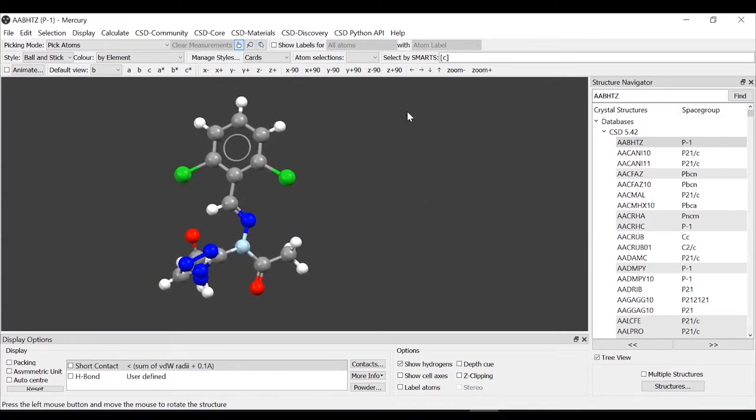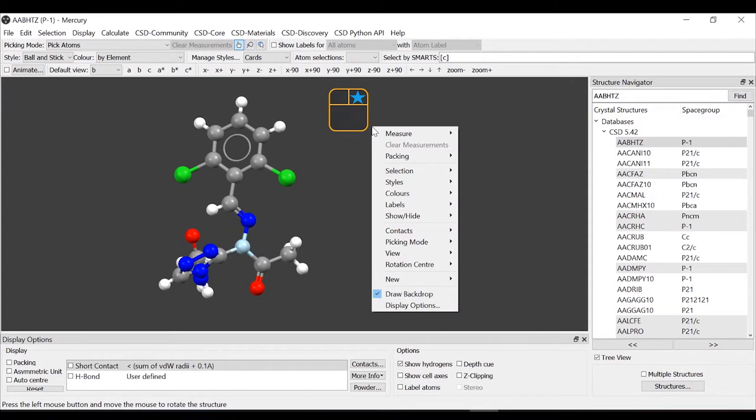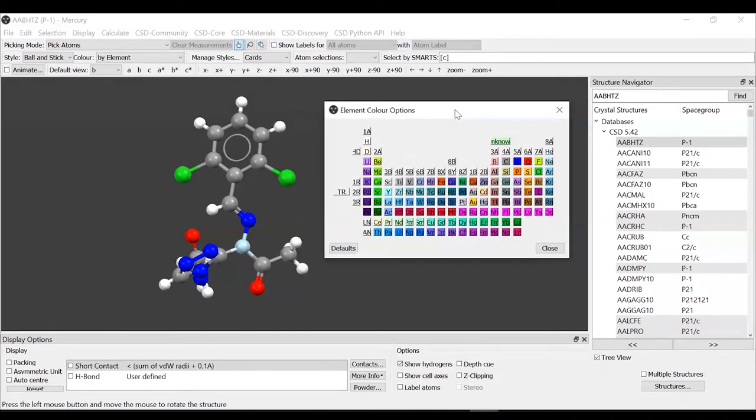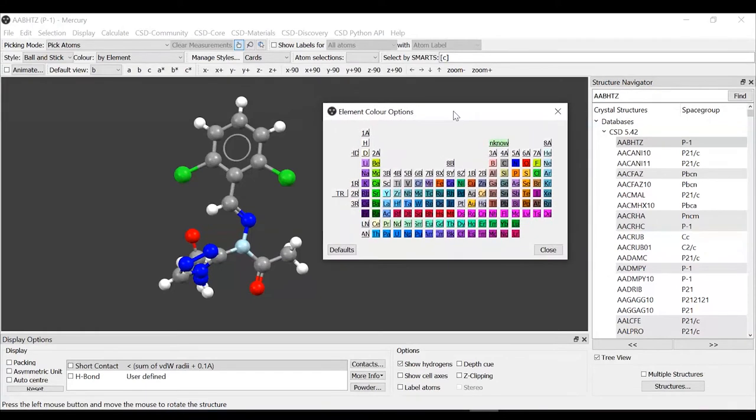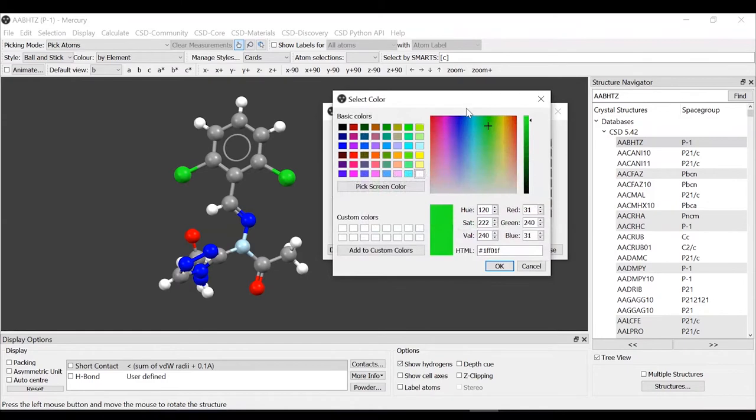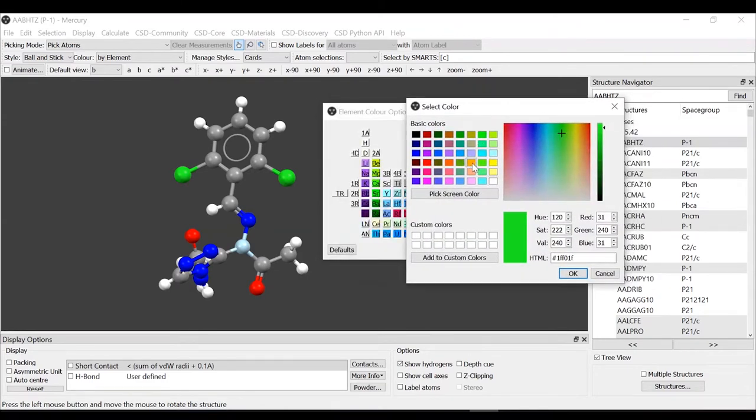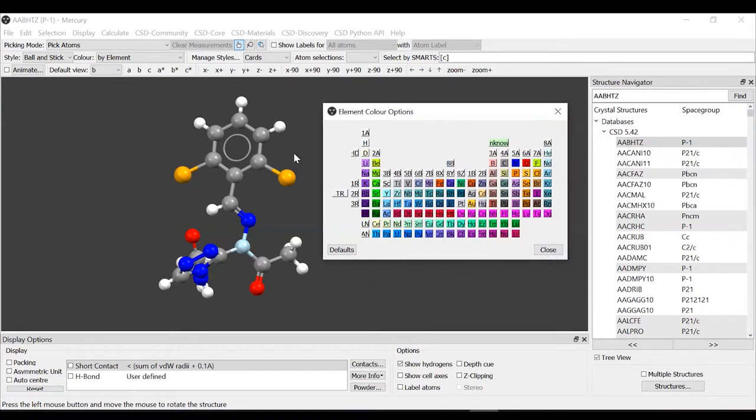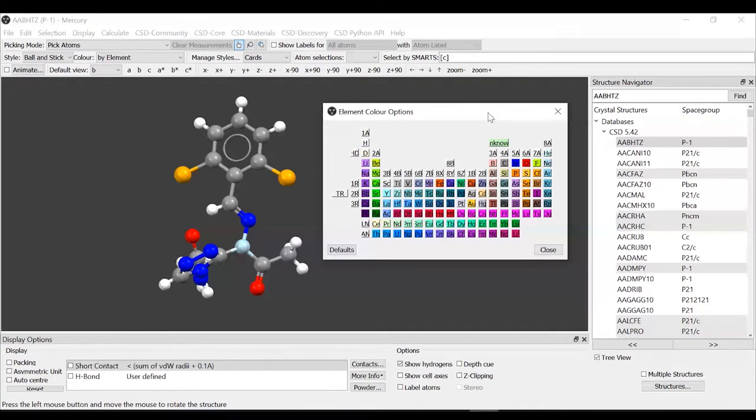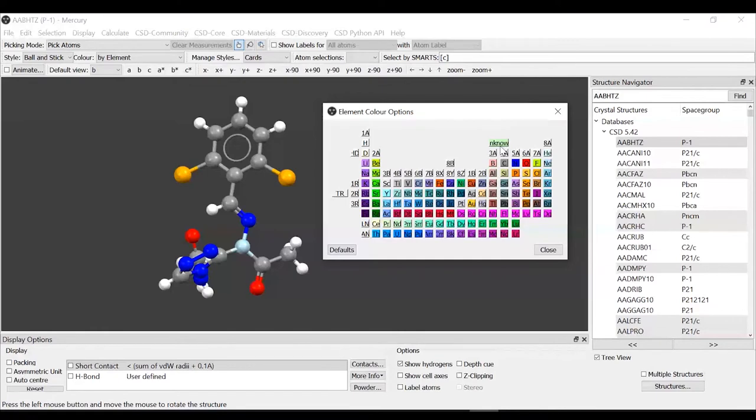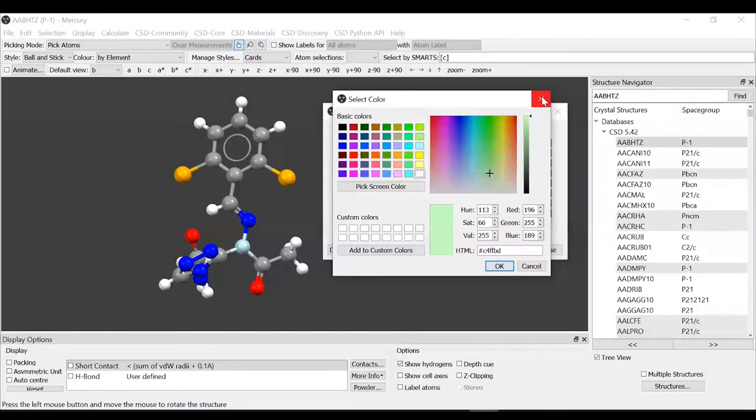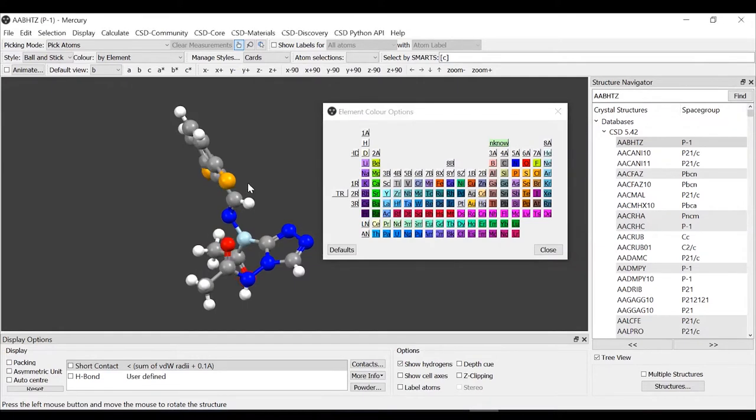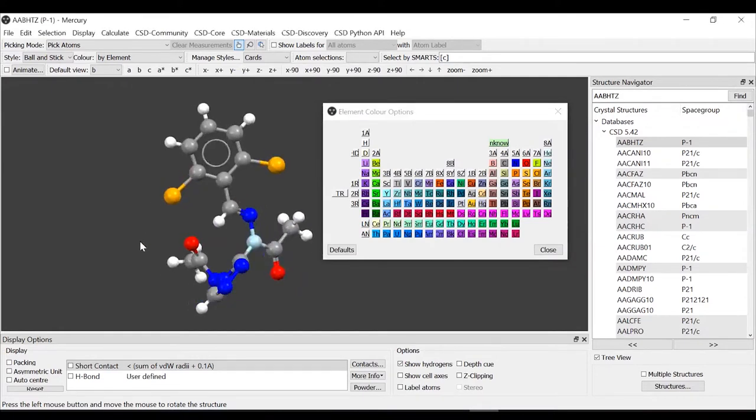If we want to change the element color, we can right click anywhere and select again colors, element colors. We brought up a periodic table where each element is represented with the colors that is used. Let's, for example, change the chlorine colors. We want all chlorine to be orange instead. The color changed on the periodic table and it changed on our structure. Just to mention the unknown element is the color that is used for the suppressed atom that you saw before in the presentation.